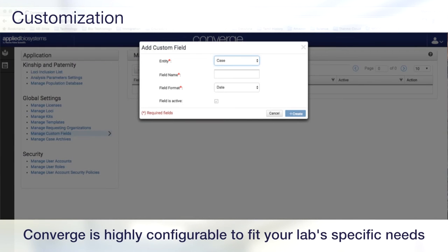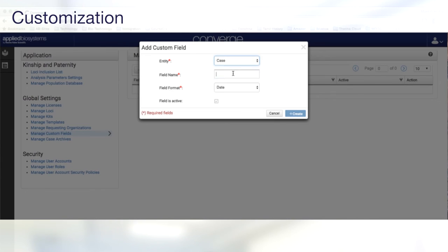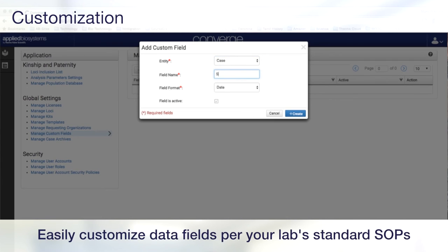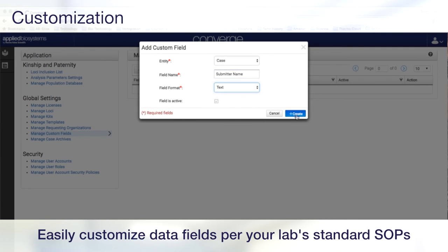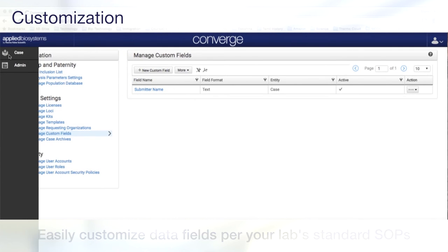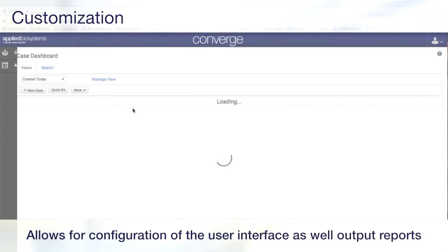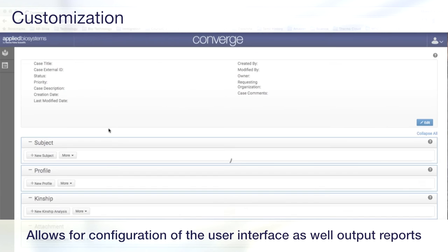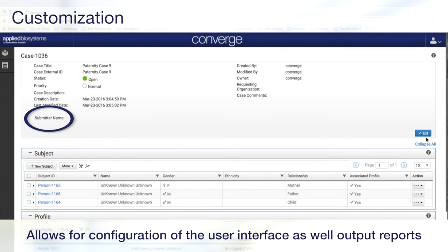Converge is highly configurable to fit specific laboratory workflows, not only for analysis parameters, but also for data fields per a laboratory's standard operating procedures. These data fields can be added to case, subject, or profile and customized for the type of data that can be entered in those fields. Converge Software also allows for configuration of the user interface, as well as output reports.